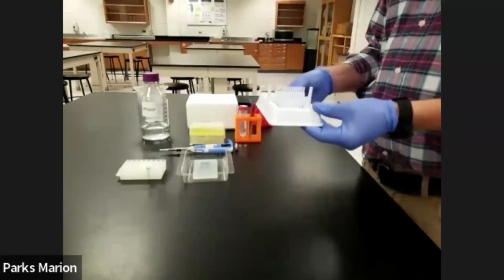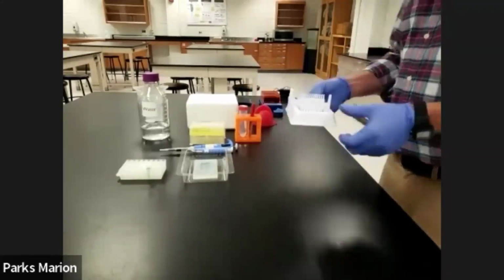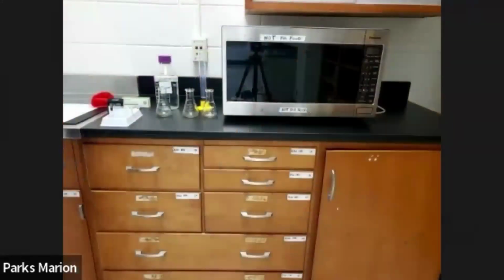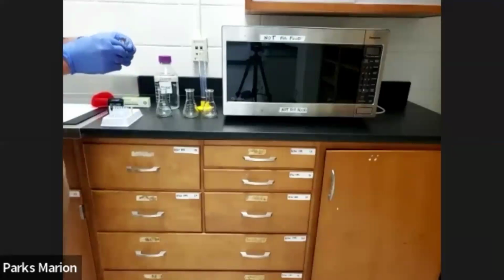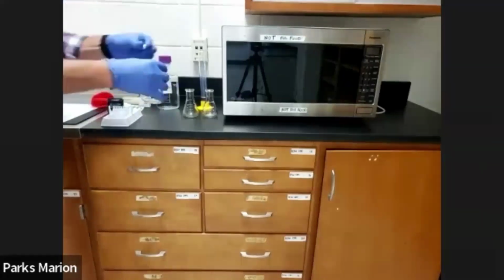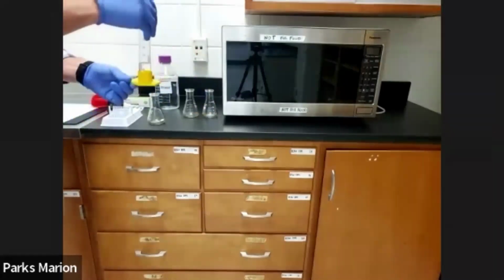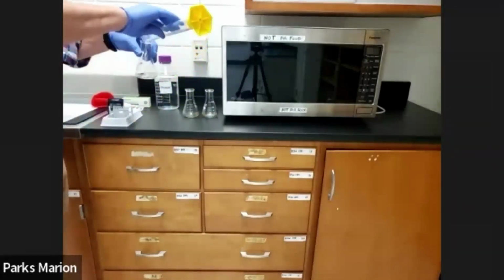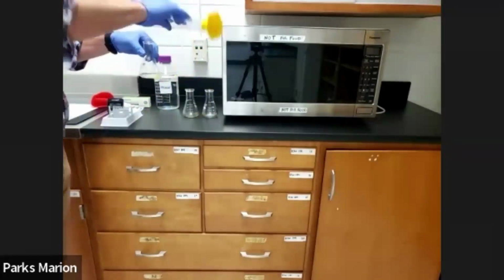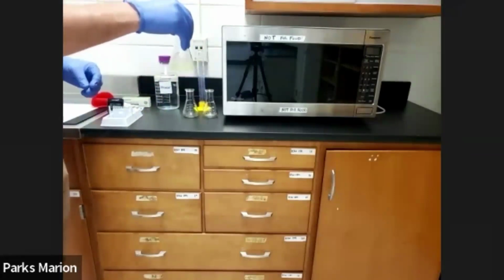To create the gel, we have to heat it up in the microwave. So come with me to the back of the classroom where we're going to dissolve our agarose and add it to our trays. To dissolve our agarose gel and prepare it for casting, we need to get our solid agarose tablets and add it to this Erlenmeyer flask. Then we'll add 20 milliliters of deionized water, which I've pre-measured, into our flask. Then I'll swirl it around to fully dissolve that tablet.